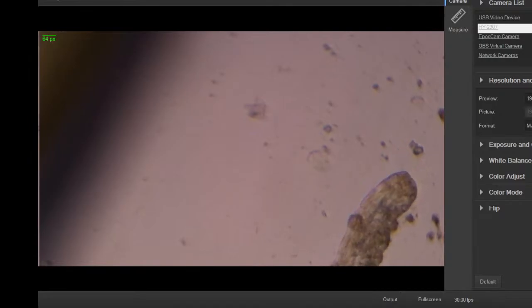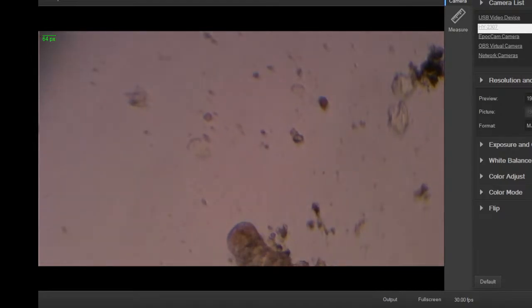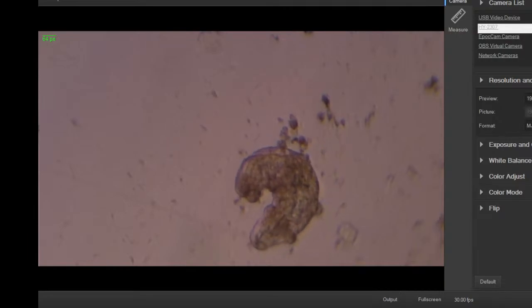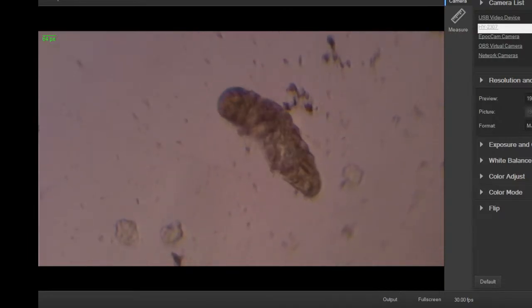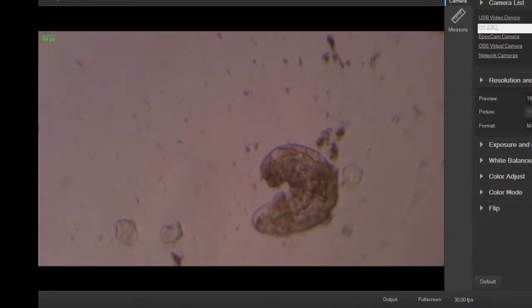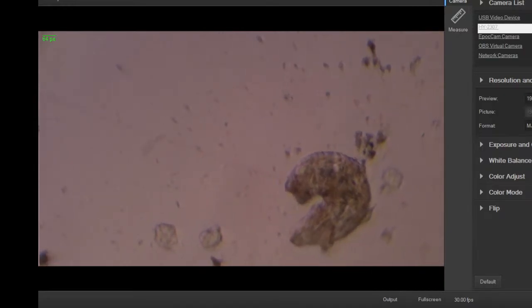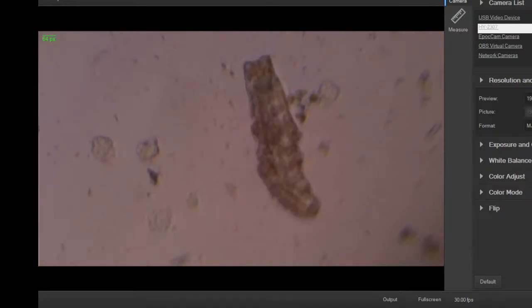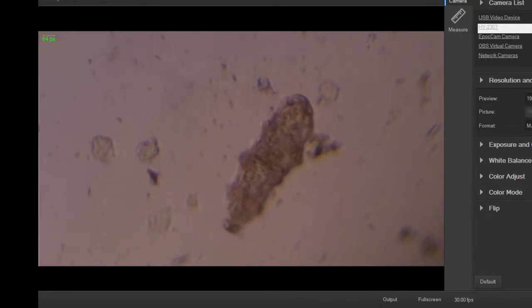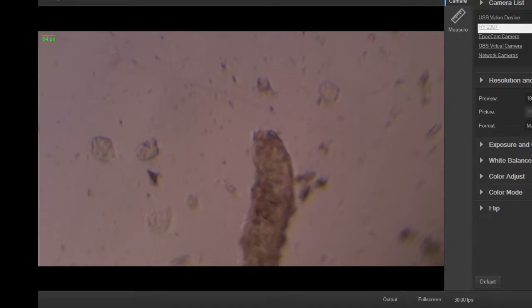They have these little stylets that poke out of the head that will stab prey, kind of suck the juices out of the prey. And if you see one of my curated videos online, you can see a dead one with the stylets kind of poking out as they relax. It also may have been kind of squashed a little bit to force them to pop out, but they're interesting little guys. They're so specific in the animal kingdom that they have their own phylum.